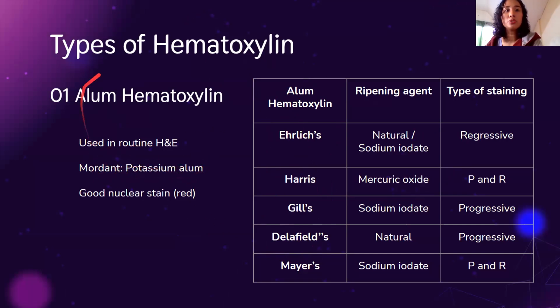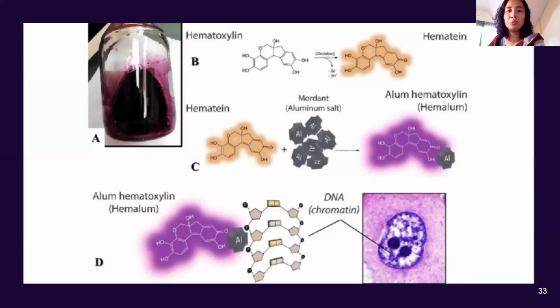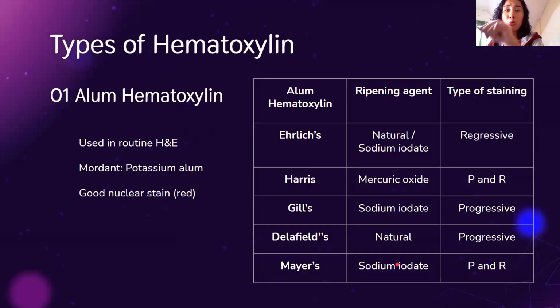So guys, once you use alum hematoxylin, the color of the nucleus still is red. Red pa siya. So nagiging blue siya. Ma'am, sabi mo yung nuclear stain, ano? Magiging blue. So, magiging blue siya after a bluing agent. Okay, wag mali ito. So, usually in itself, red pa talaga. So, hematoxylin plus a mordant plus red ang labas.